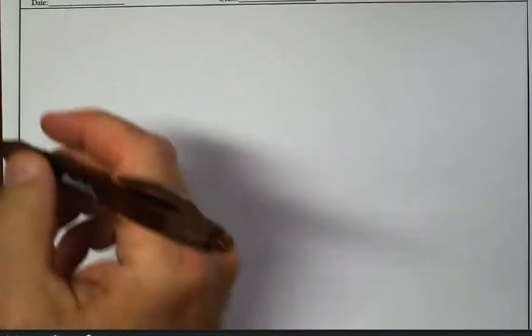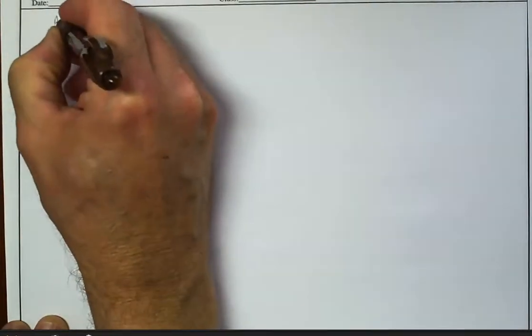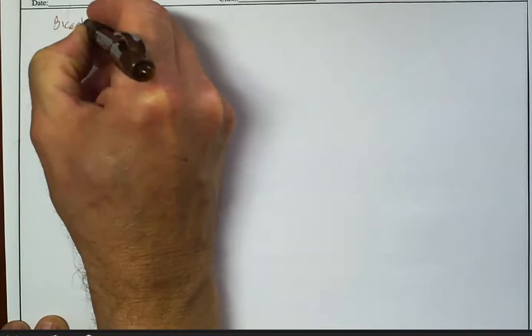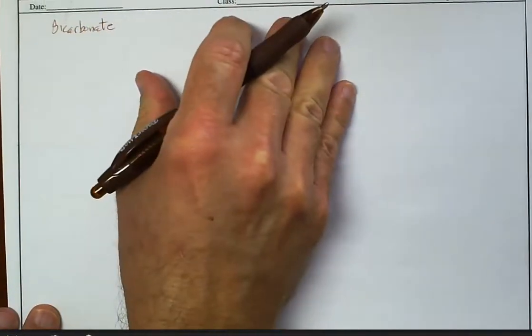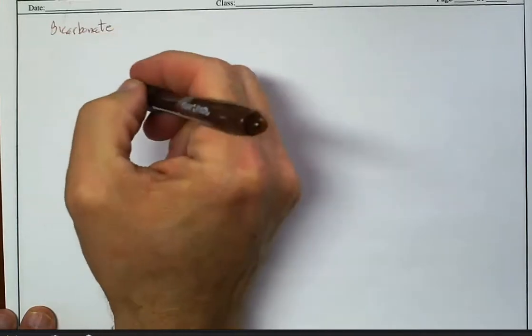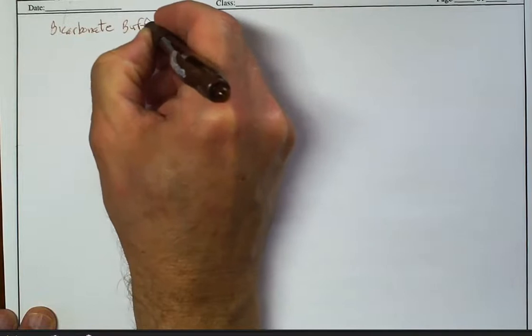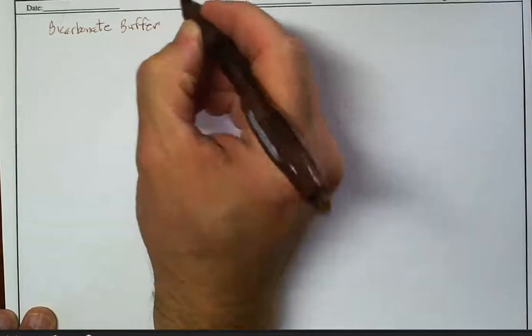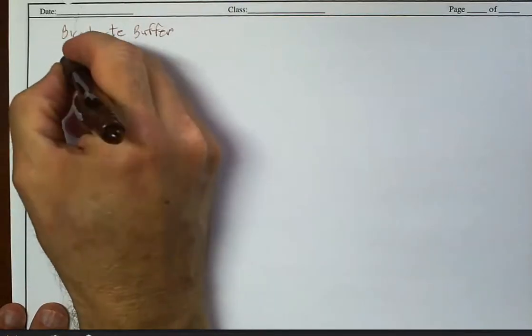All right, I mentioned earlier that I wanted to tell you a little bit about the bicarbonate buffer system. And I want to create a laboratory version of the bicarbonate buffer. I'll let you see it actually work. But let's look at the background here.